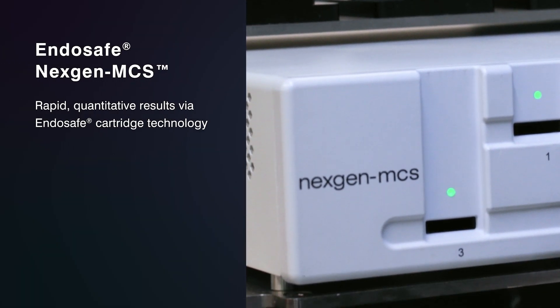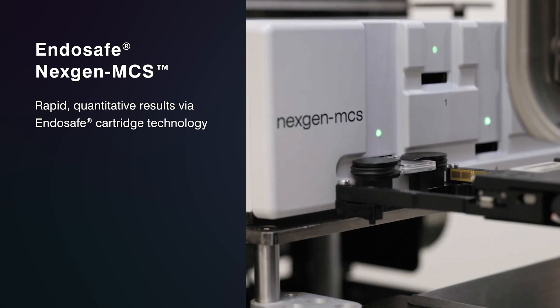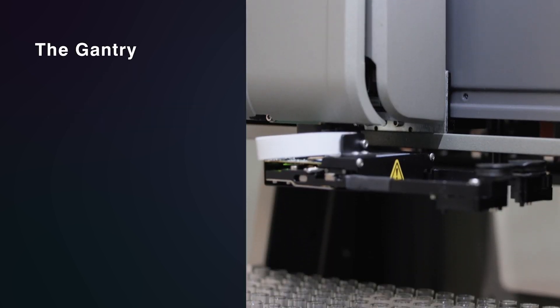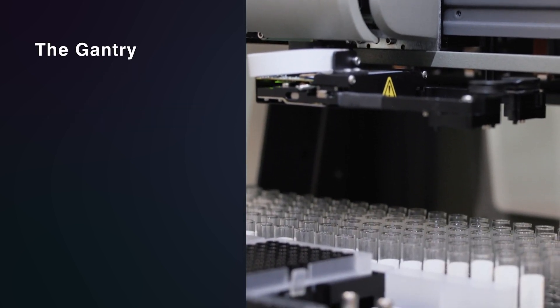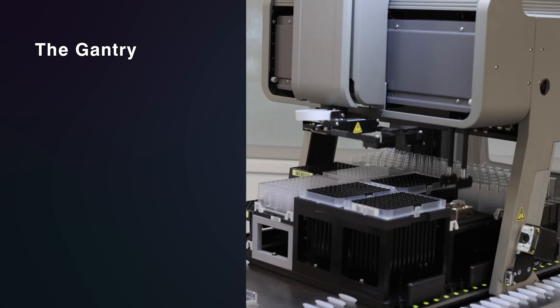The EndoSafe NextGen MCS tests up to five samples in about 15 minutes through the use of EndoSafe cartridge technology. The gantry contains four pipette heads and a gripper which efficiently moves samples, diluents, accessories, and cartridges around the deck as needed.